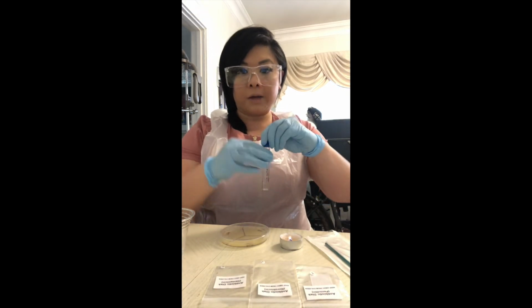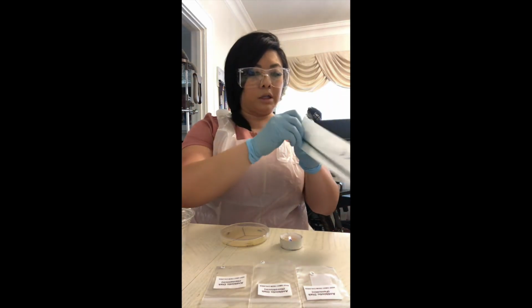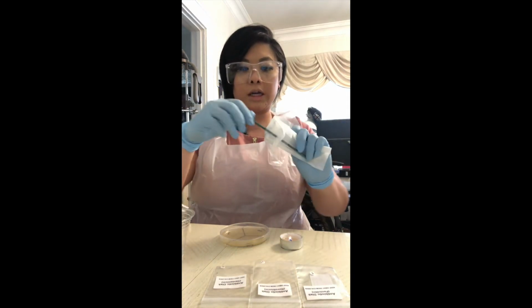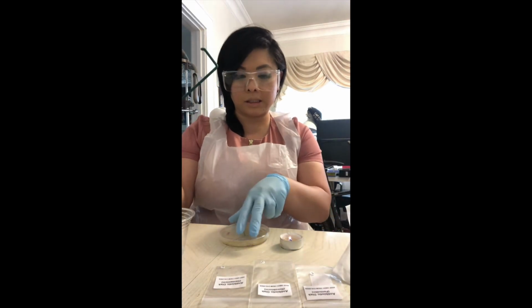And then in the lab kit, I've been provided with an L-shaped spreader. So when I open it, I'm only gonna touch the long straight end. And it's already sterilized because it's in sterilized packaging.